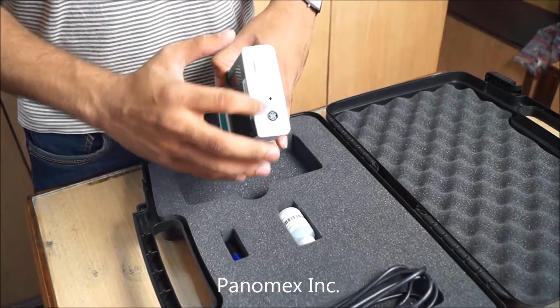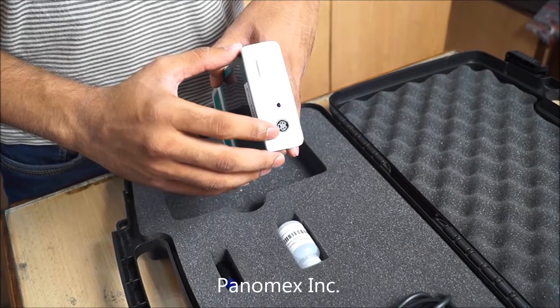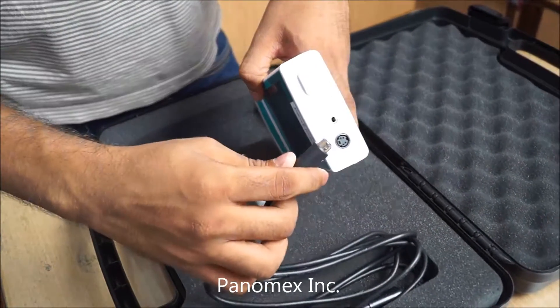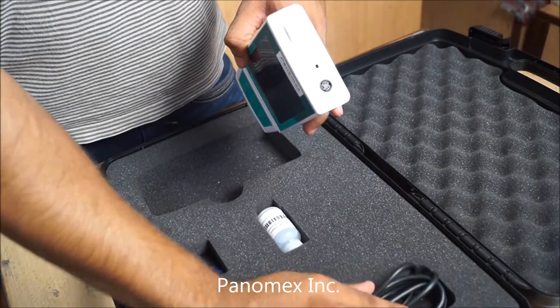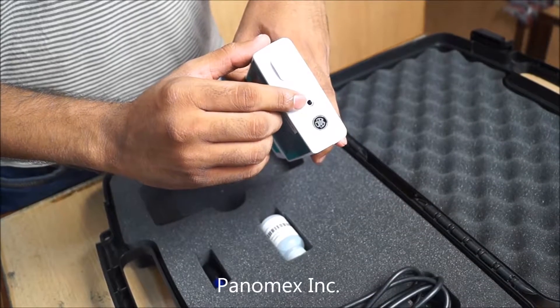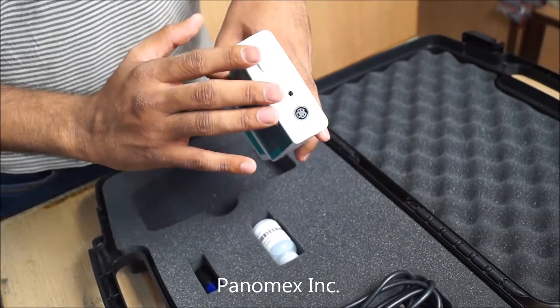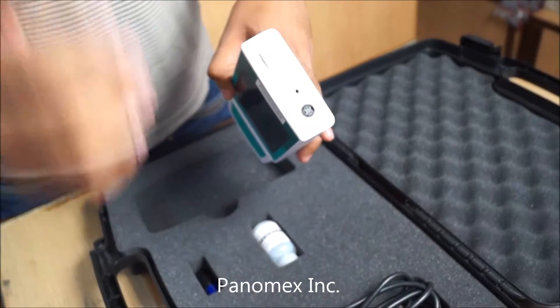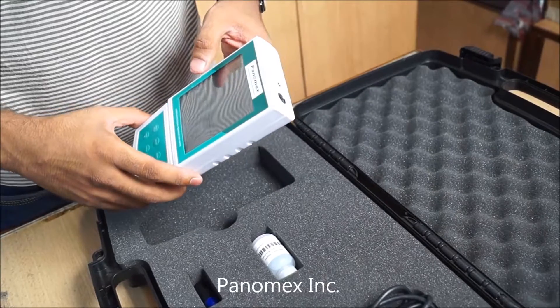There are two connector sockets. This connector socket is for the DO probe — you can connect it like this. The other connector socket is for the temperature probe. As we are only demonstrating dissolved oxygen here, we are not using the temperature probe.